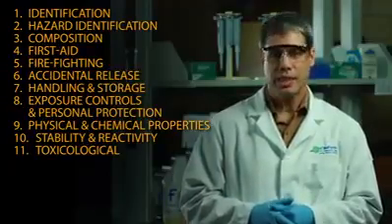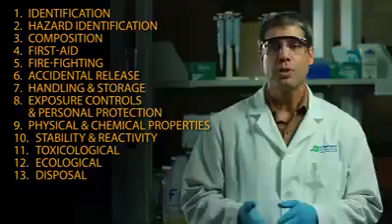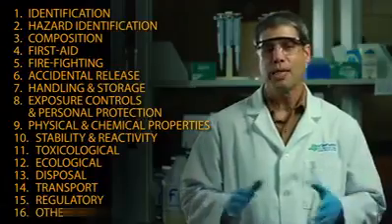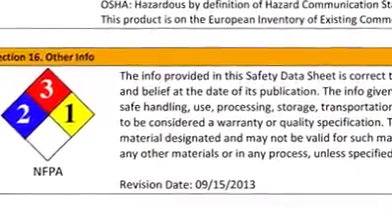Sections 12 through 16 aren't mandatory, but you should at least be familiar with them: ecological, disposal, transport, and regulatory considerations. Section 16 is for any other pertinent information. This is where you'll find the date that the SDS was prepared along with the last known revision. Safety data sheets provide a lot of information about how to use chemicals safely in the lab.